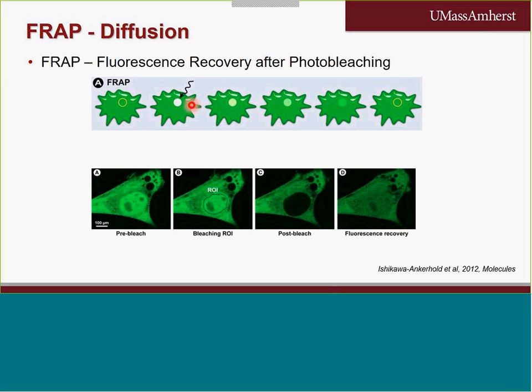And now you keep on observing the sample under the microscope for a long time. It allows you to figure out the diffusion of the surrounding dye into the region that has been affected by the photobleaching. Here you have an actual sample.